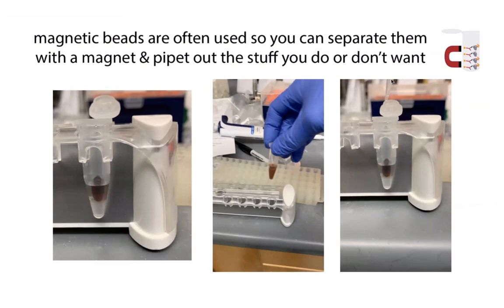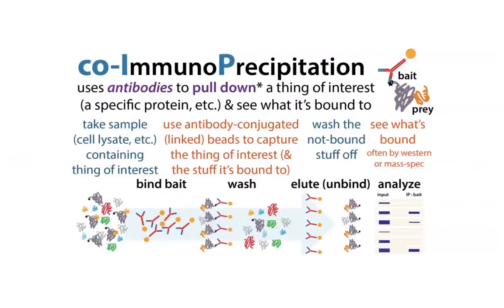It makes me really happy to use, except when the stand's not cooperating and stuff. But anyway, having this magnetic form is really, really handy. You're then able to isolate your thing, wash off other things, then elute your protein and analyze it. So in order to elute it, there are various ways.